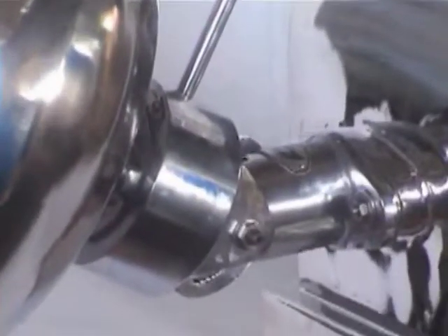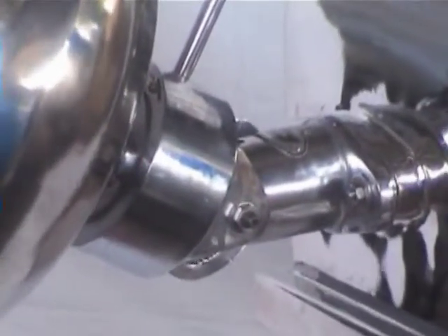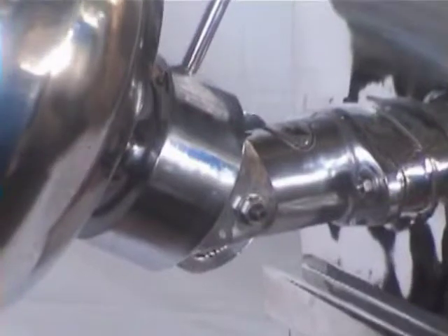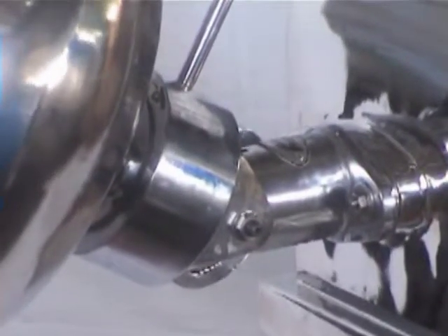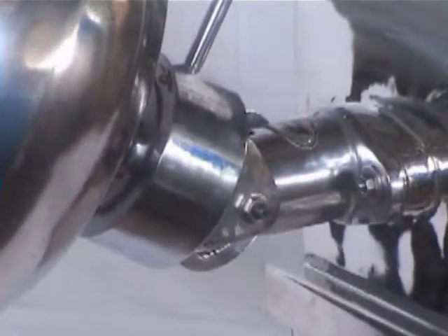This is the universal gearing attachment which can give the angular effect to the pan, wherein you can vary the degree of the angle which is required for coating.